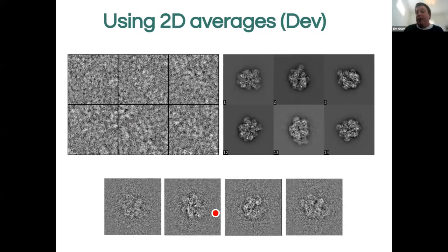And this leads to much increased robustness because now we have greater signal in our images. Basically, we got this to work in the first place, then we can use the fact that we got this to work to get higher SNR in our images that we're using for the AbInitio. And so this works very nicely. And so if you're having problems with AbInitio, I would recommend trying it. We're also investigating using this process to enhance 3D reconstructions themselves, but I don't have results to show on that right now.